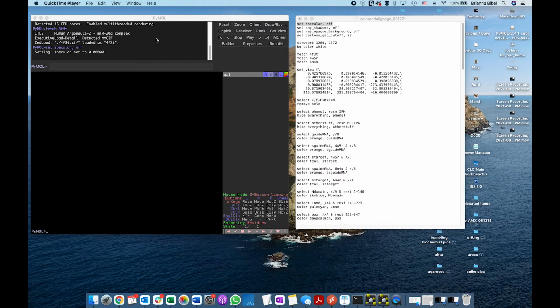So when you open PyMol, you have this command line place, and then things are going to show up here. You have these button things, which we'll look at a little later, which can deal with movie things and exporting figures. Over here is going to be our object and selection list, with actions and showing things that you can do here, and our proteins are going to show up here. You also have a toolbar on top with a bunch of things, and there are a lot of different ways to do everything, so I'm going to try to show you a few different ways to make a simple movie.